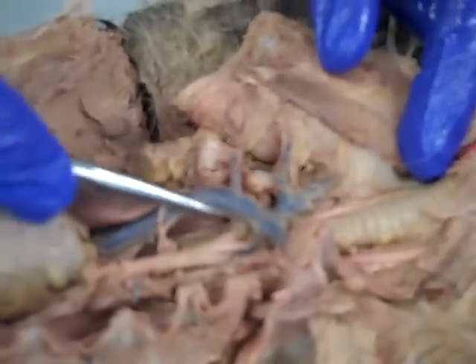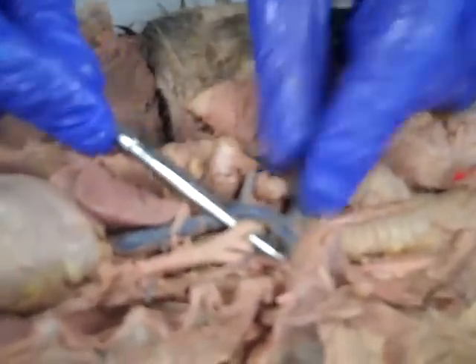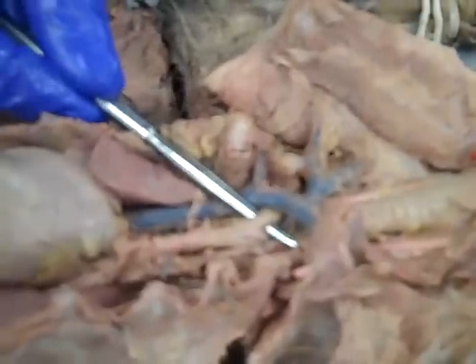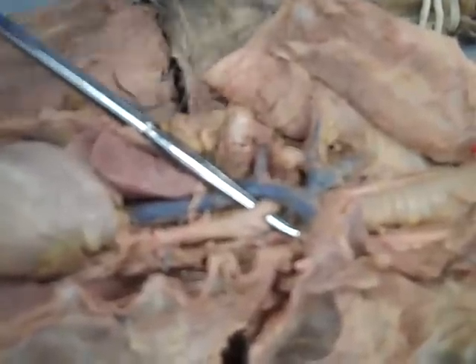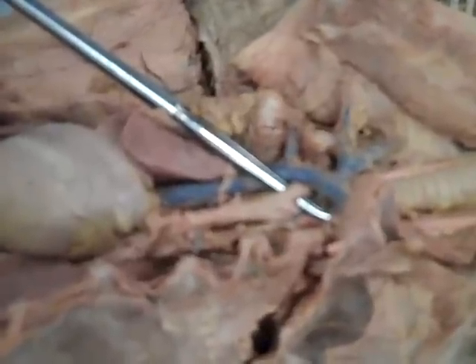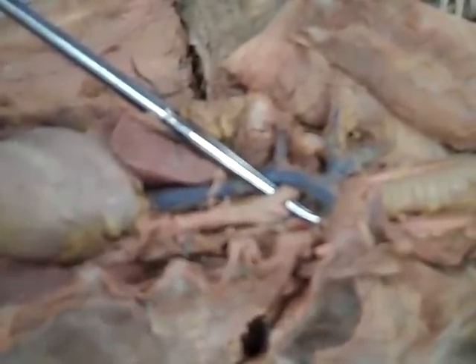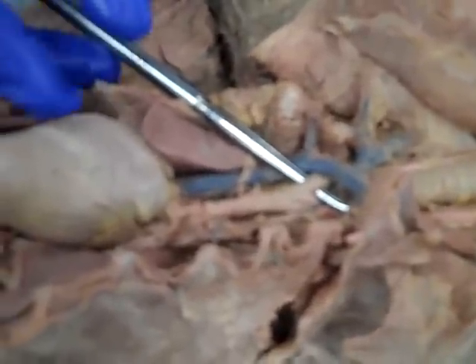The last branch we've got right over here, that's the right subclavian artery, which is going to do the same thing that the left subclavian did. The only asymmetrical thing is where we start. On the right side, we're starting from the brachiocephalic. On the left side, we're starting from the aortic arch, which I almost forgot there. That was the reason for that pregnant pause. What else?